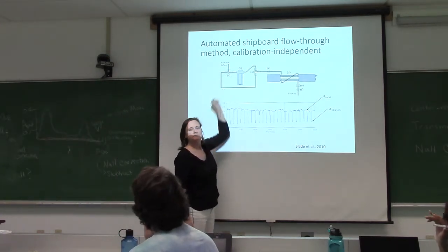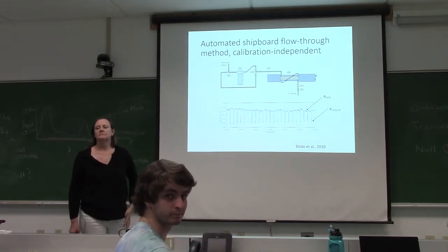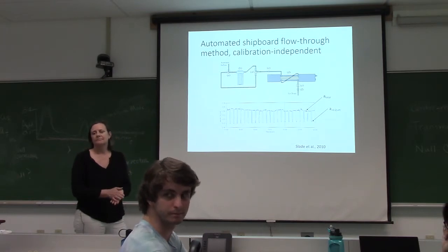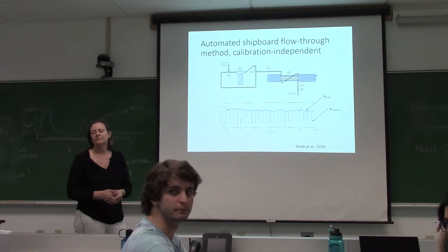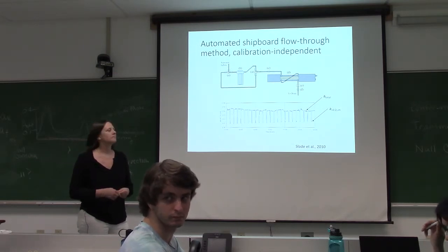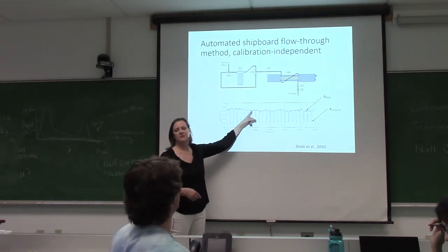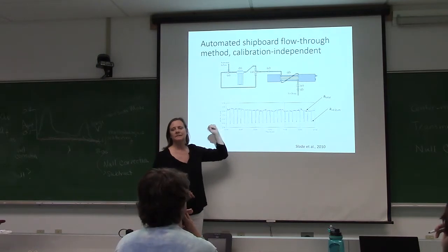Just warning, it has to be the same water. You're assuming that dissolved materials have not changed between the measurements, or you interpolate between them and assume that the linear interpolation between them is the right approach. But you can monitor that with an in-line fluorometer too, so you know there's no changes when you cross the front. So you should always keep track of what this looks like. But this brings us to another quite important issue.